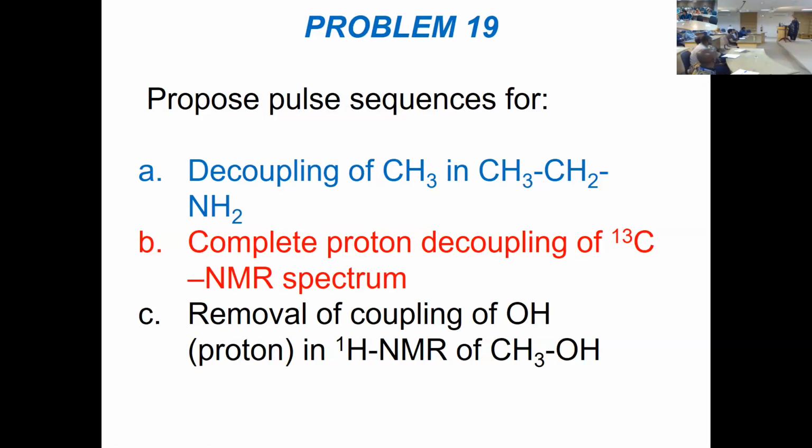So with the increasing number of experiments, signals overlap and you get very sharp, intense peaks, while your baseline gets thinner and thinner. So this is what signal to noise ratio is. The signals are overlapping and noises are random, so they just cancel out each other.